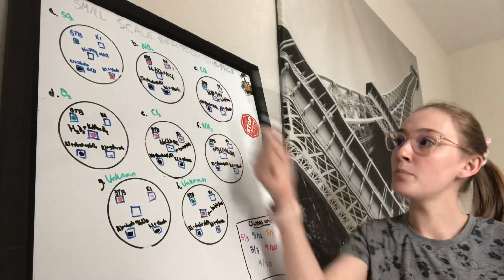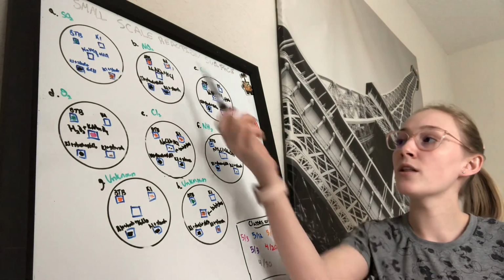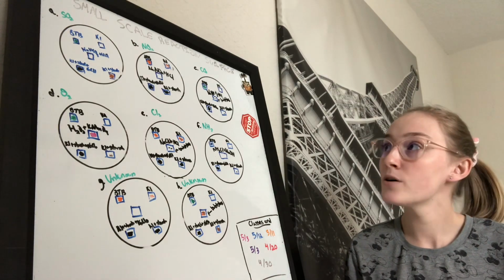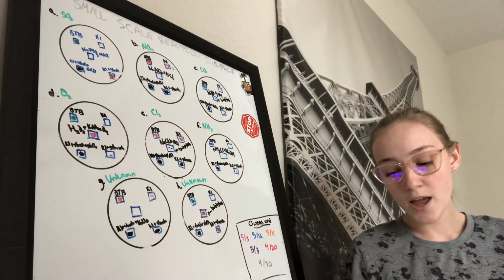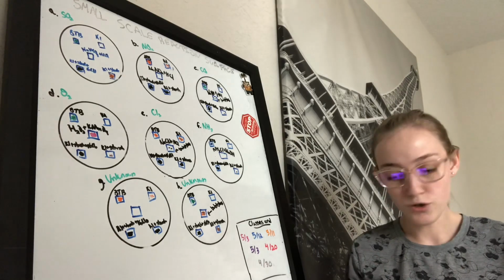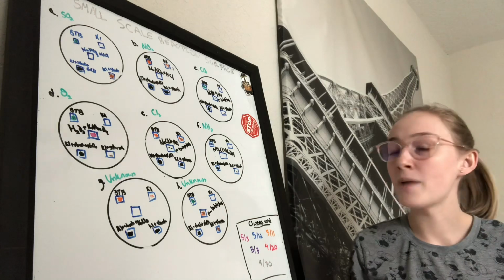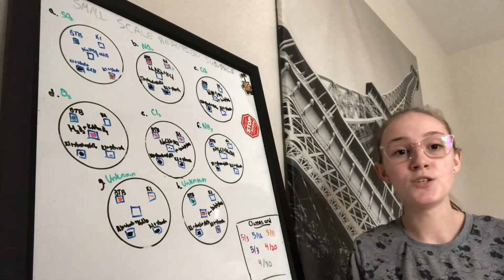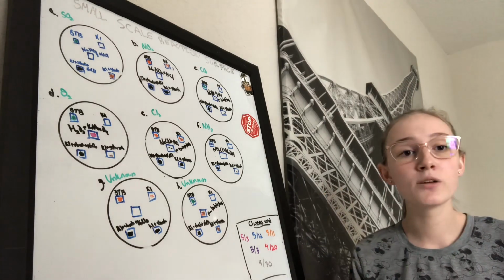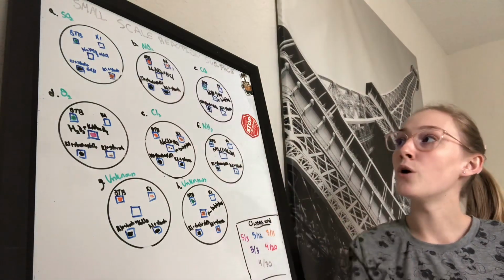So for B, you have NaNO2 plus HCl. The color indicators that changed: BTB changed into that orange-yellow. KI changed into a yellow color, and then you have KI plus starch plus NaClO. That didn't change. That stayed the same as a black. And then you have the KI plus starch, which went from a light sandy pink color to a dark or a black with a little bit of orange in there. So with those color changes, that helps you come to the conclusion that it was NaNO2.